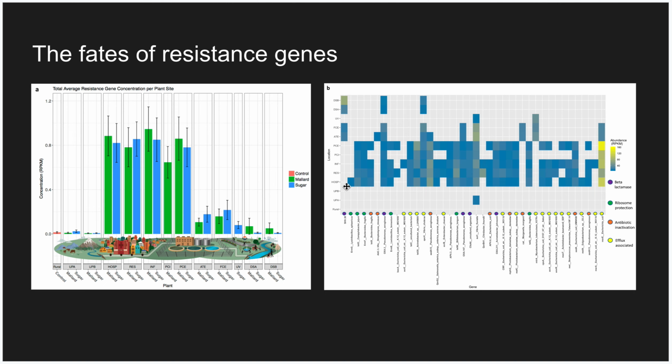And you can see that in the samples that we have chosen for you that come from the upstream A sites, which are the most distant upstream sites, from the residential influent, the aeration tank effluent, which is after the first step of the treatment process, and then released water at a downstream site.